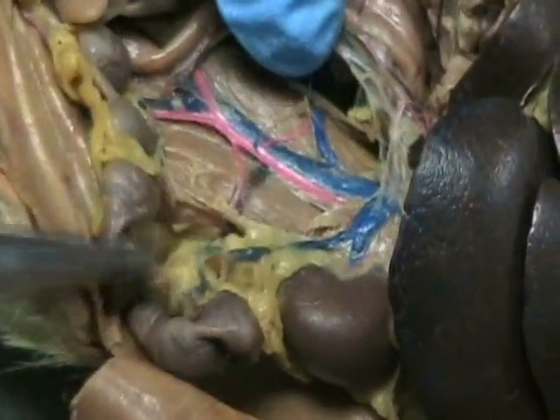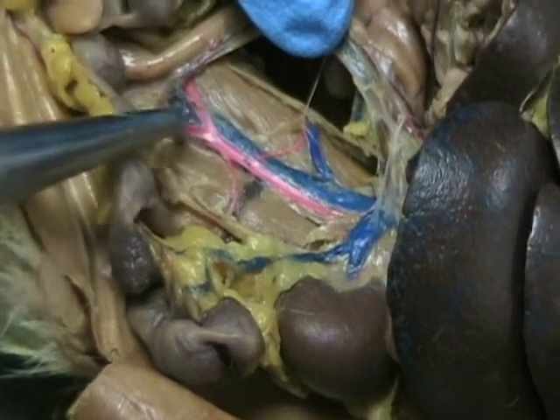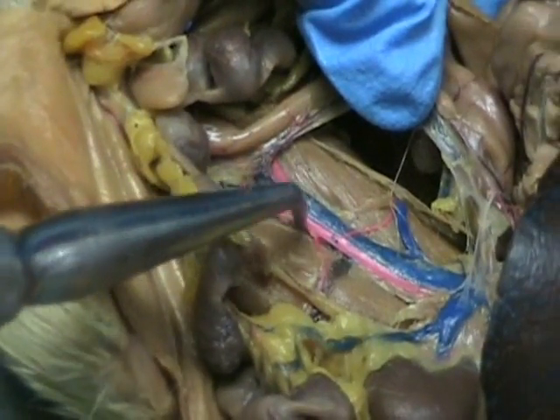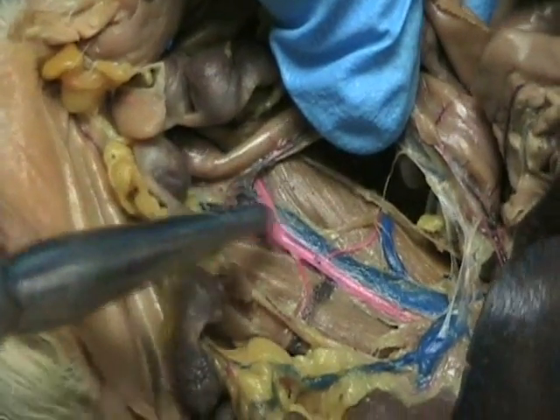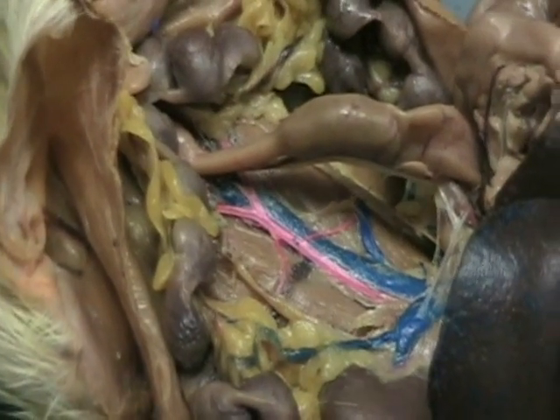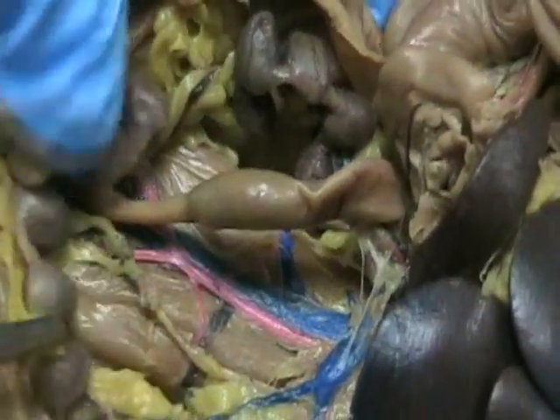Find it. All right. So after those circumflex iliacs, you're going to have a split in the dorsal aorta. And that's where you get your common iliac arteries. Common iliacs. And those go to the legs. And then that second page that we had, here's the common iliac, and eventually it splits and all this stuff. But we decided not to make you know it. Okay?